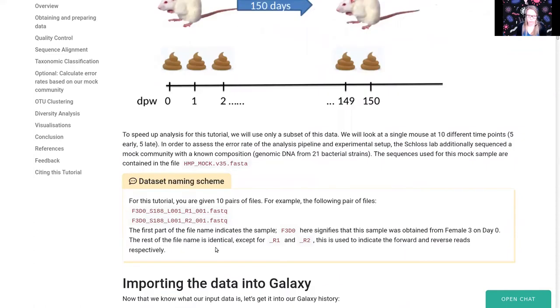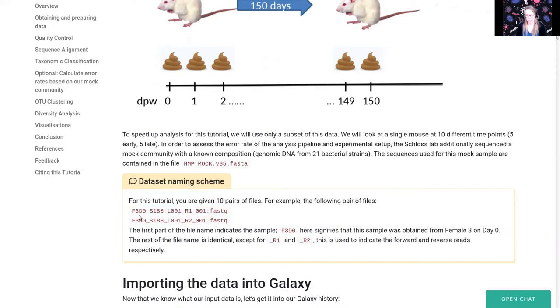A quick note about the dataset naming scheme: sample names start with something like F3D0, which means female mouse number three on day zero. Since we're doing paired-end sequencing, every sample consists of two FASTQ files, identical in name except for R1 for the forward reads and R2 for the reverse reads.